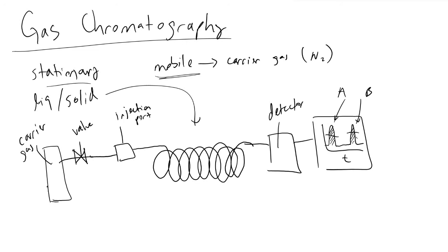And another thing that one should note from chromatography is the rate at which these two species A and B will travel through our chromatographer machine are dependent on their affinity for the stationary and or mobile phase.